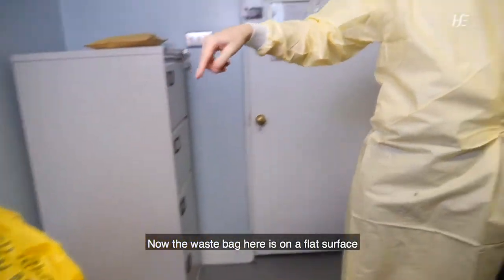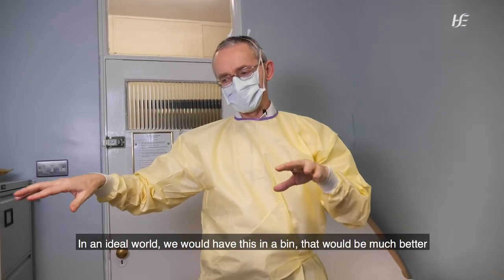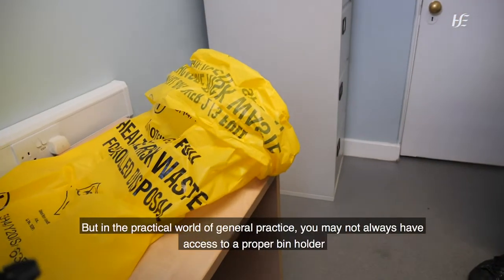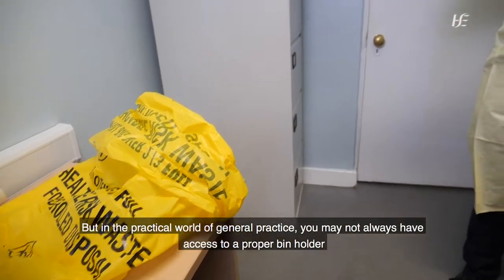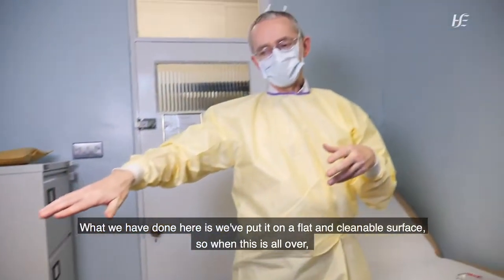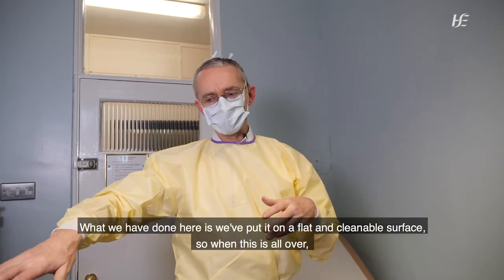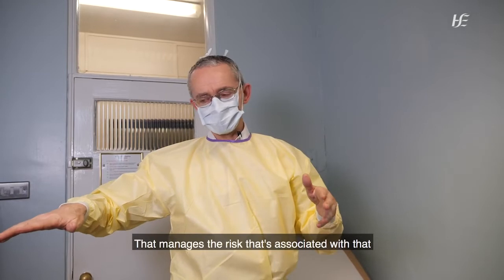Now, the waste bag here is on a flat surface. In an ideal world, we would have this in a bin, would be much better. But in the practical world of general practice, you may not always have access to a proper bin holder. So what we have done here is we put it on a flat and cleanable surface. So when this is all over, we can clean and decontaminate that surface, and that manages the risk that's associated with that.